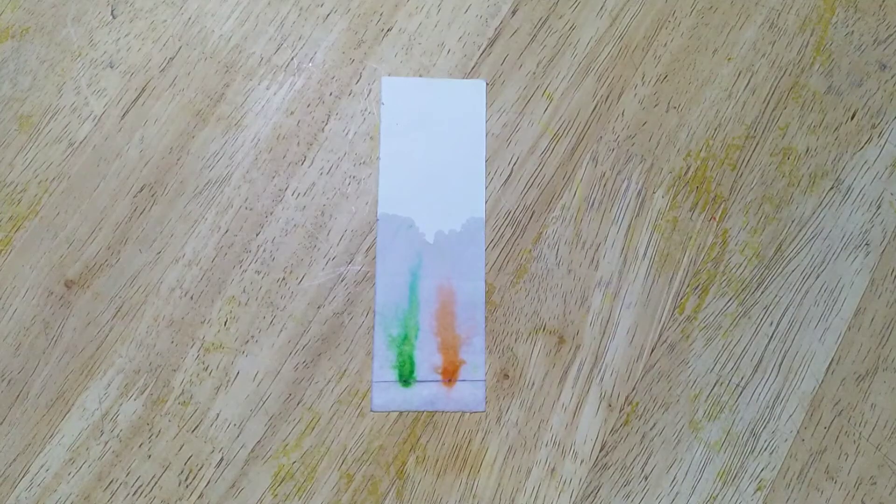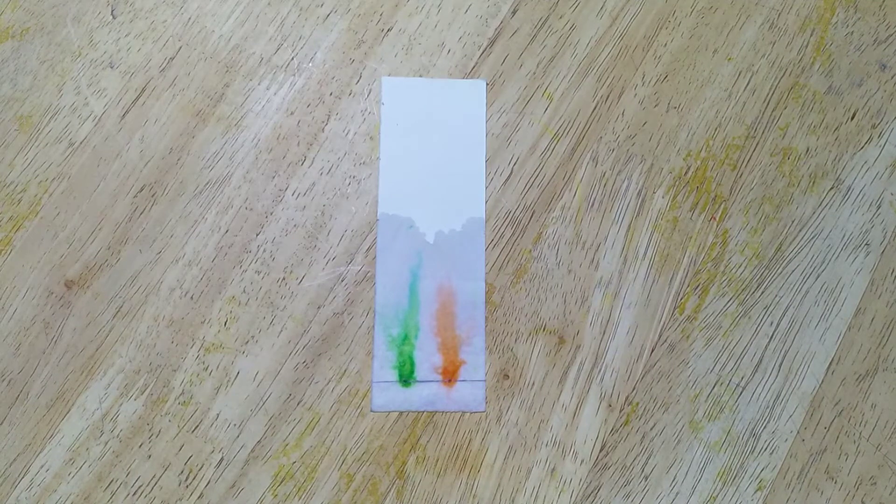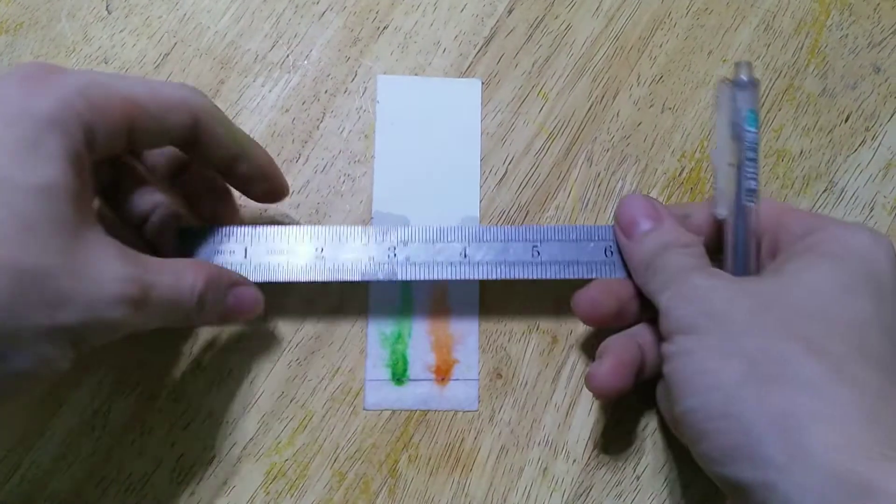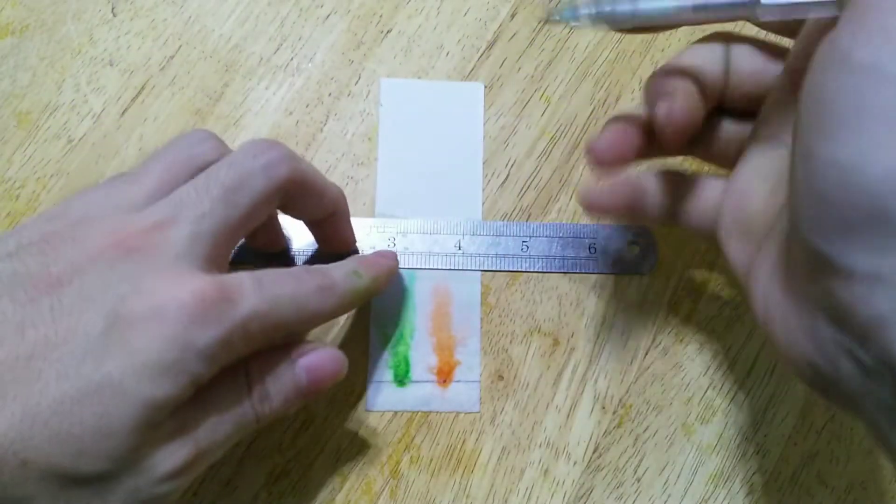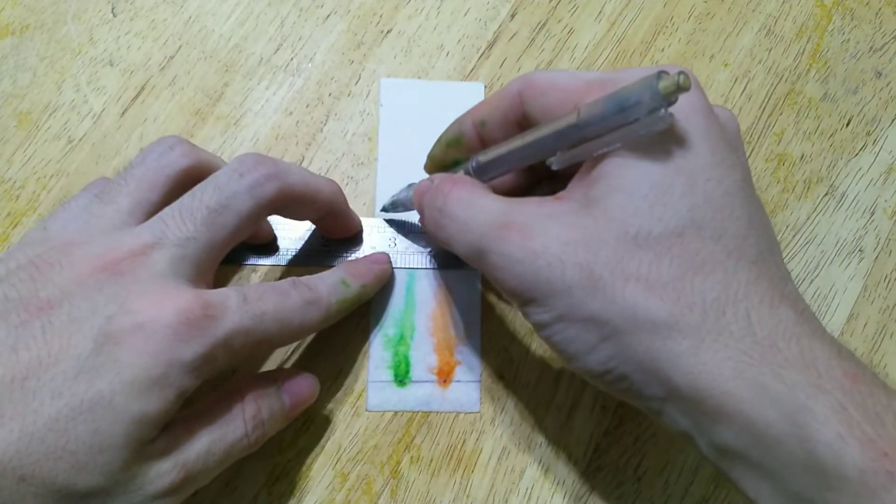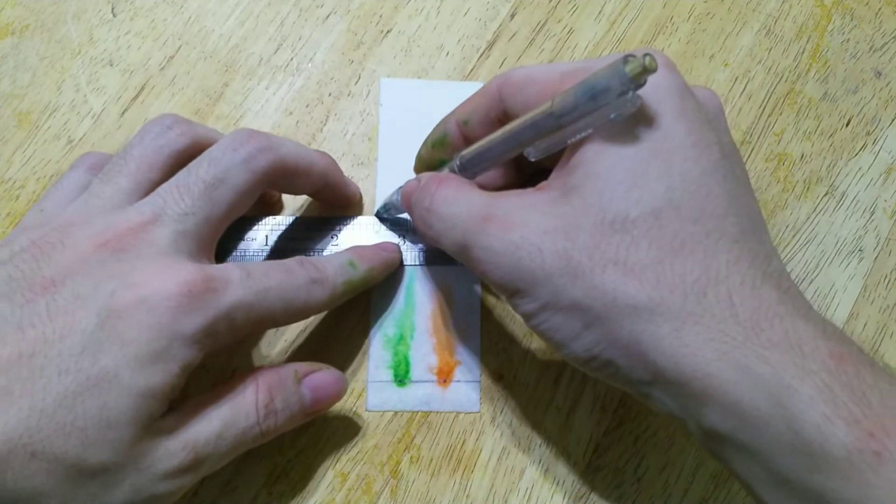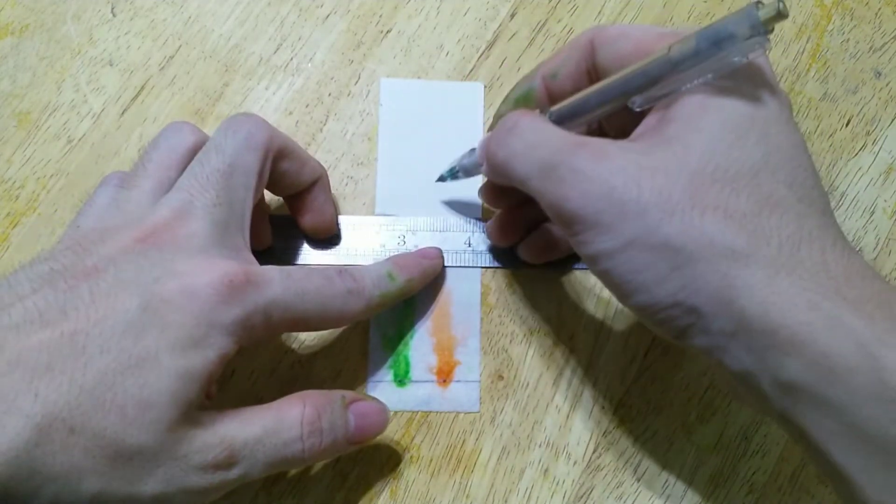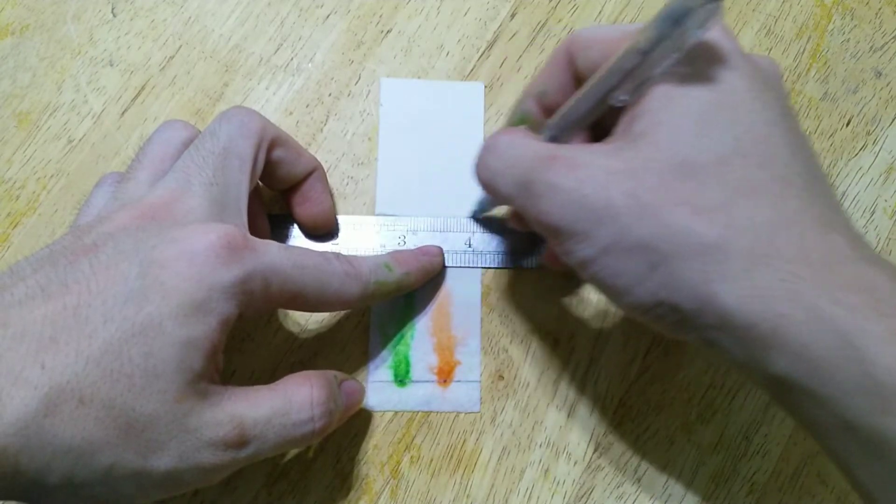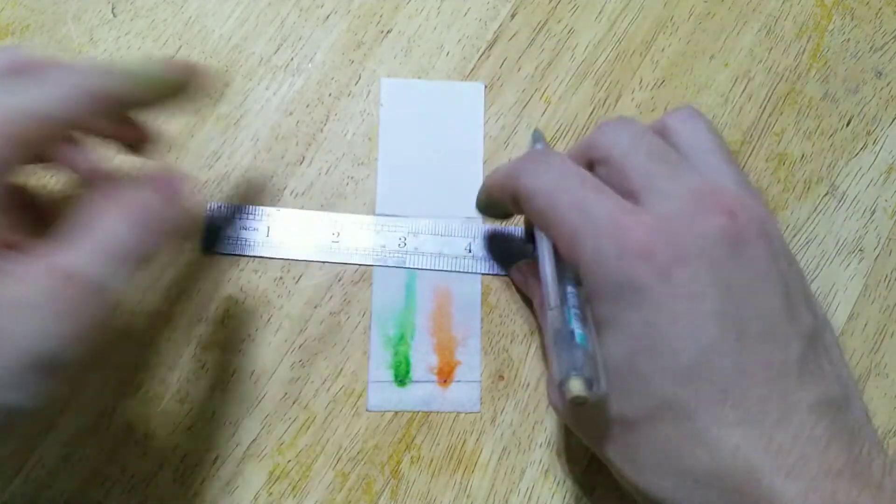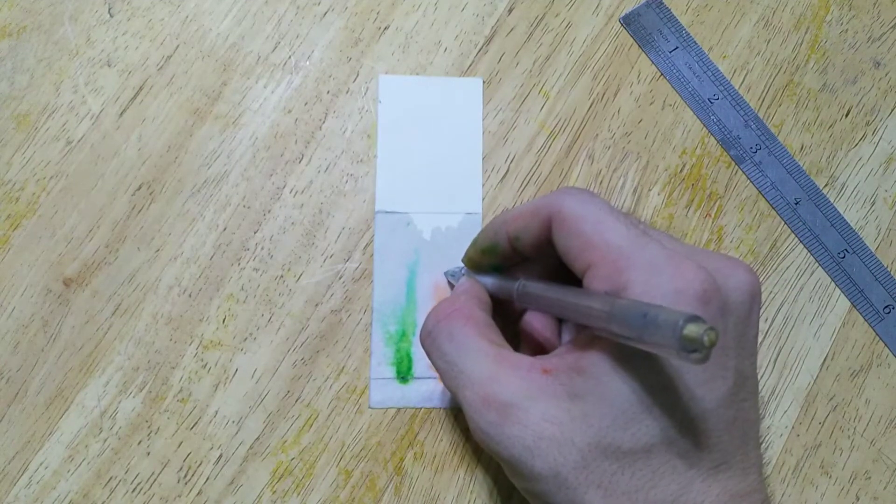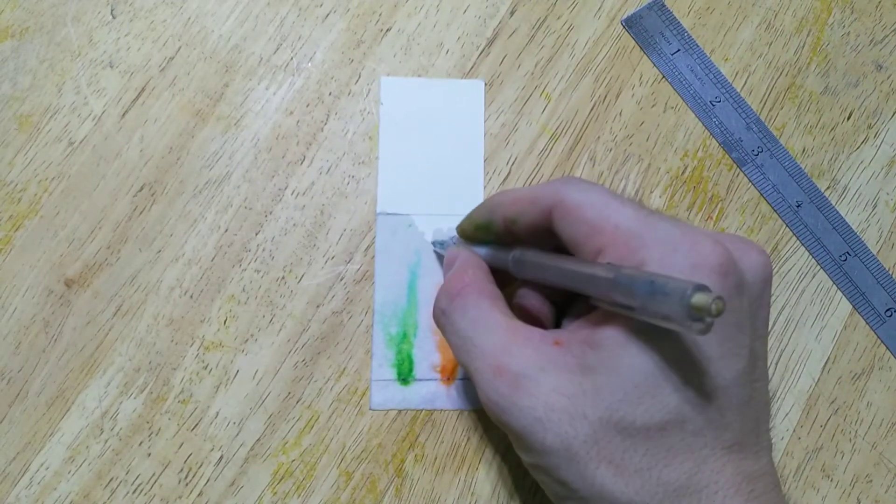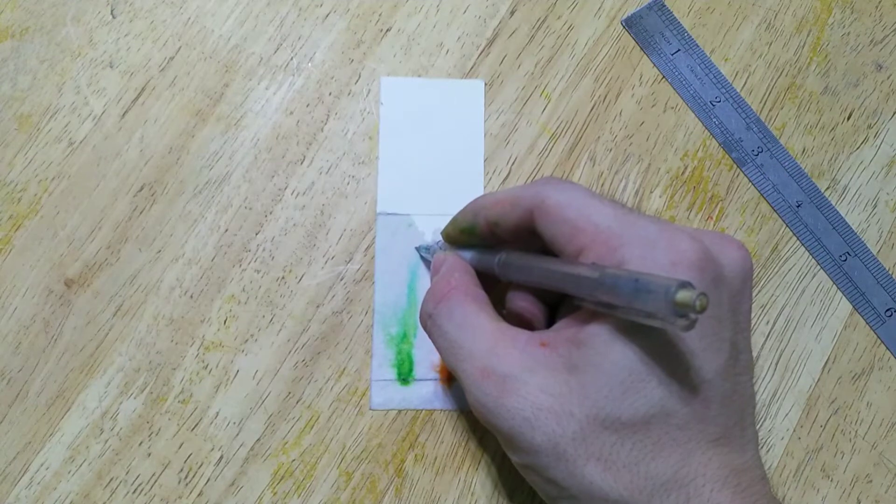After almost 8 minutes, I take out the TLC plate from the jar and immediately use the ruler and the mechanical pencil, draw a line to the mobile phase so we can observe it when it dry and mark the color for the distance traveled.